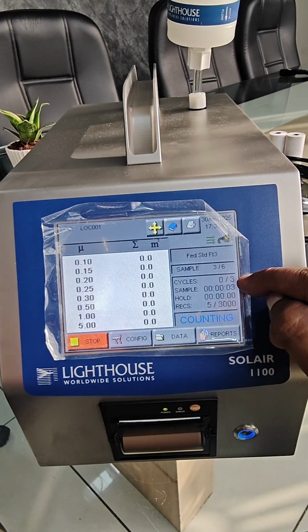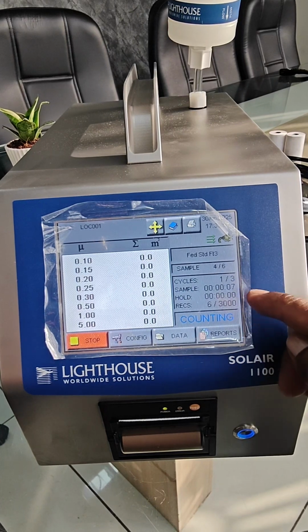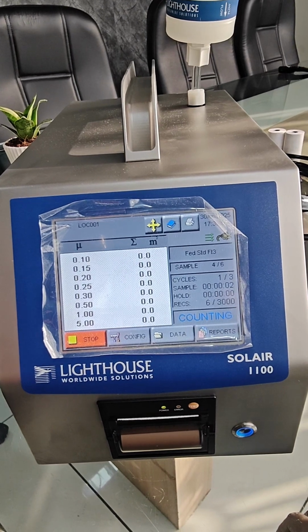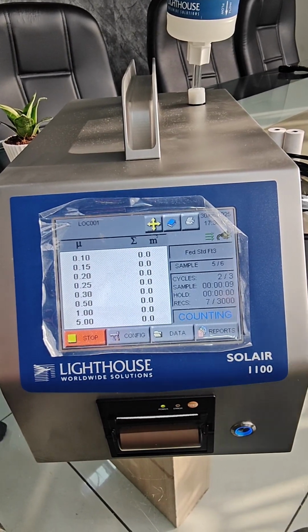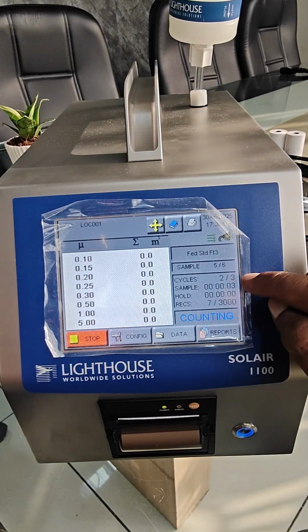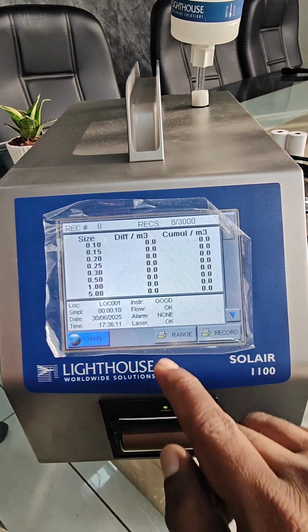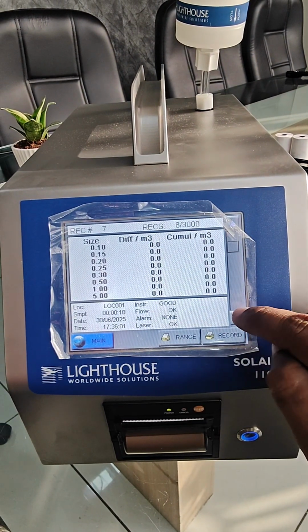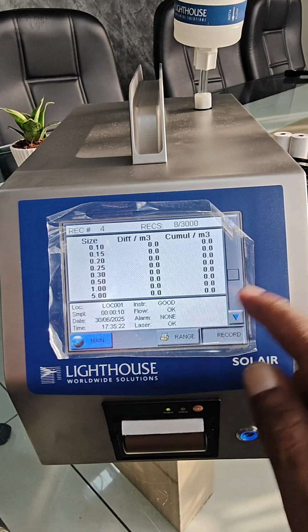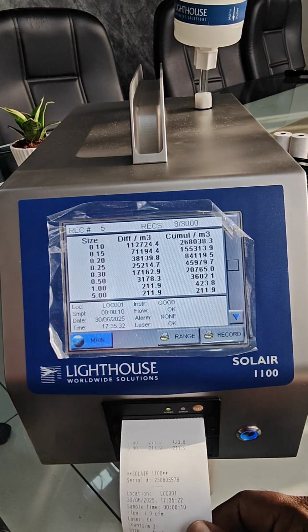And there are 3 cycles of 10 seconds. One cycle is almost finished. Second one is running. And third one. So 2 almost finished, and now the third one. Okay. These are the data. Okay. If you want records, you can have a printout of this. If you want a printout of this, you can have a printout like this.